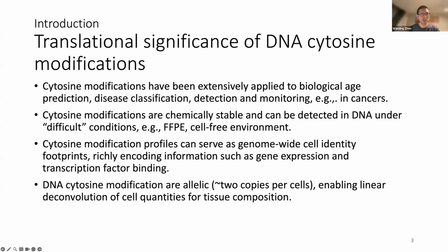notable. Cytosine modifications attract a lot of attention recently due to their translational significance. For example, people have successfully leveraged cytosine modifications to build data science models to make chronological or biological age predictions, to classify diseases, and to track and monitor progression of these diseases, most notably cancer.